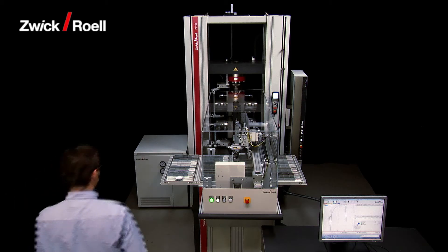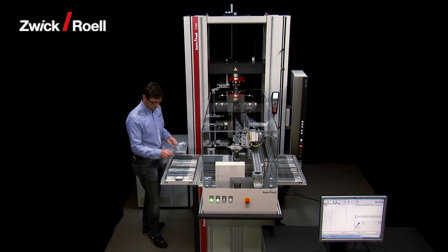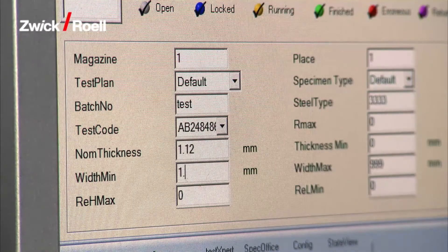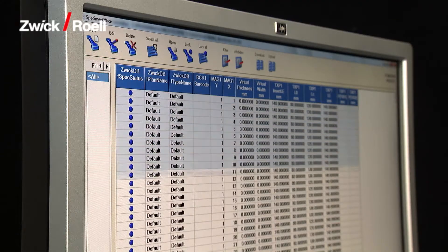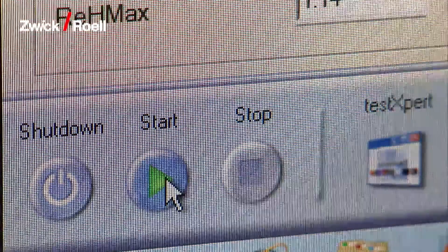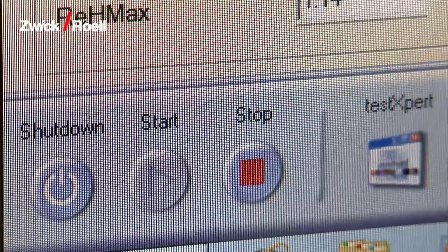The system is very simple to operate. In the first step, the operator sorts the specimens into the magazine. The operator then inputs the relevant data for the tests to the database. Alternatively, this can be supplied automatically by a superordinate host computer. The next step is to start the system in automatic mode.